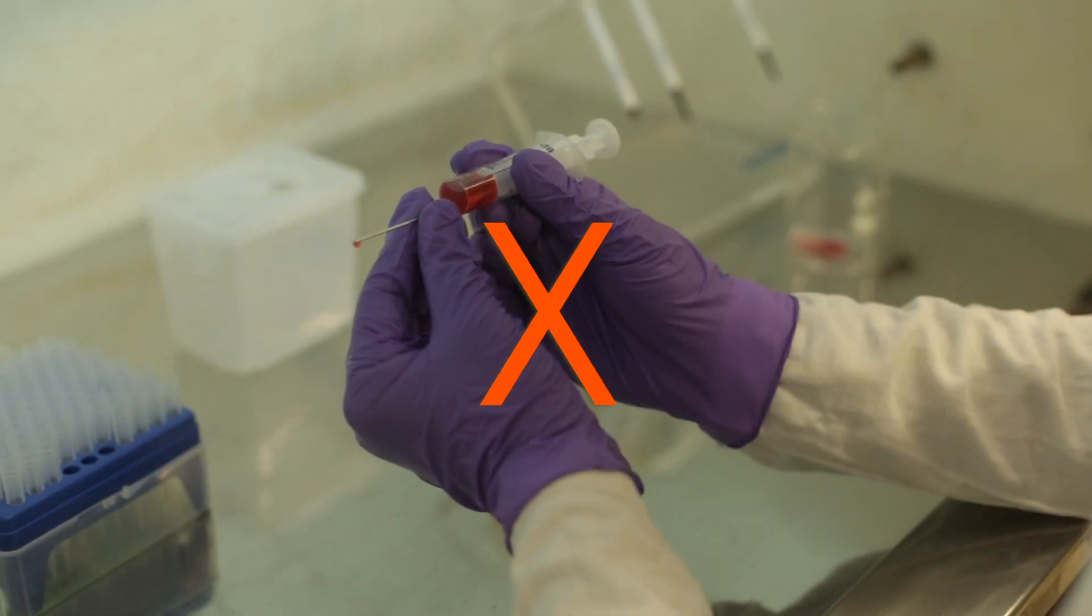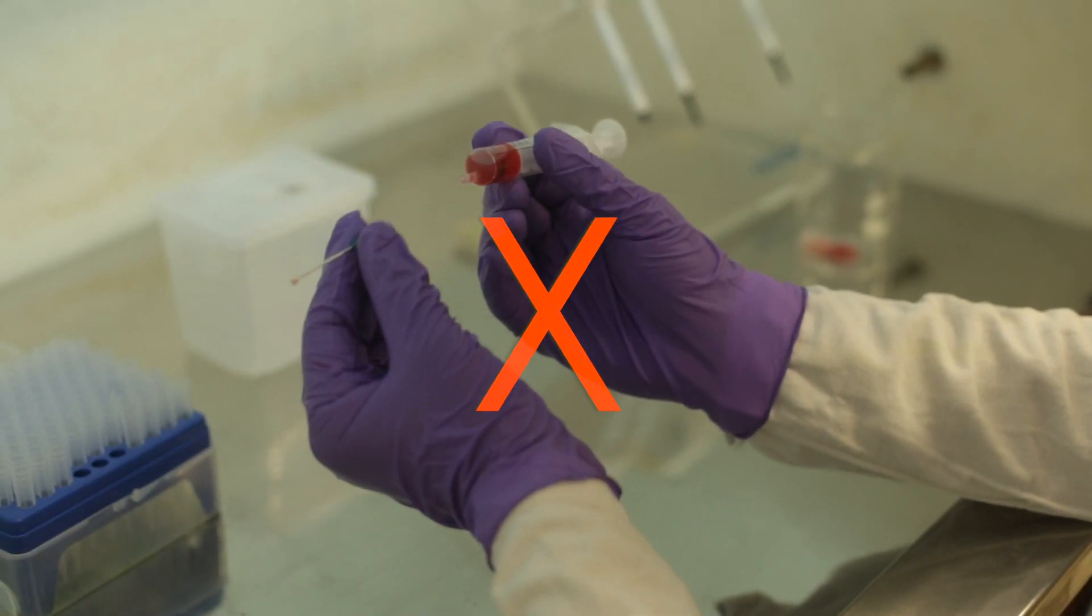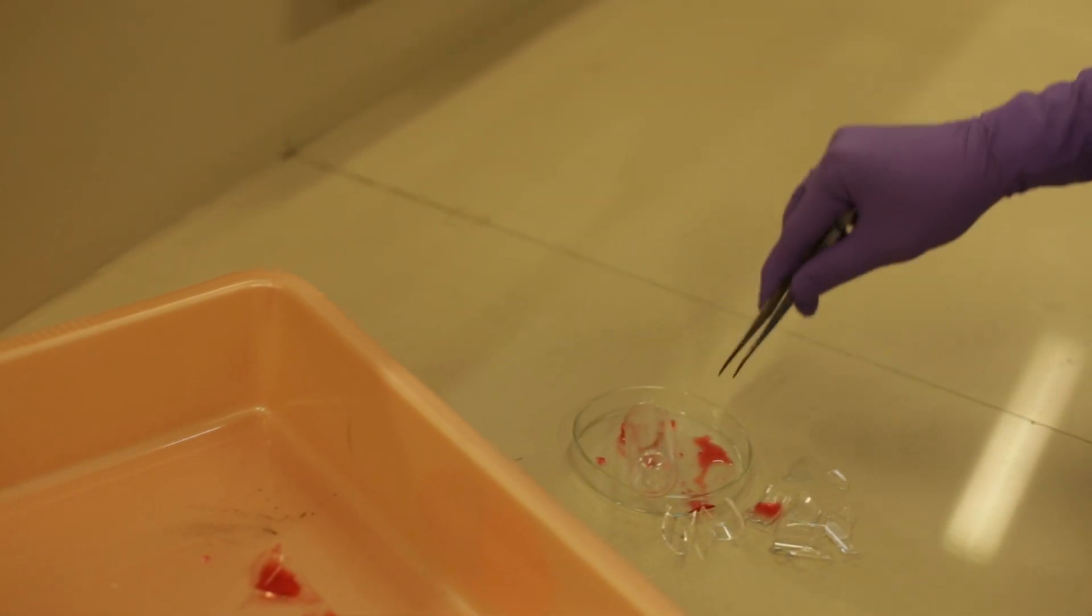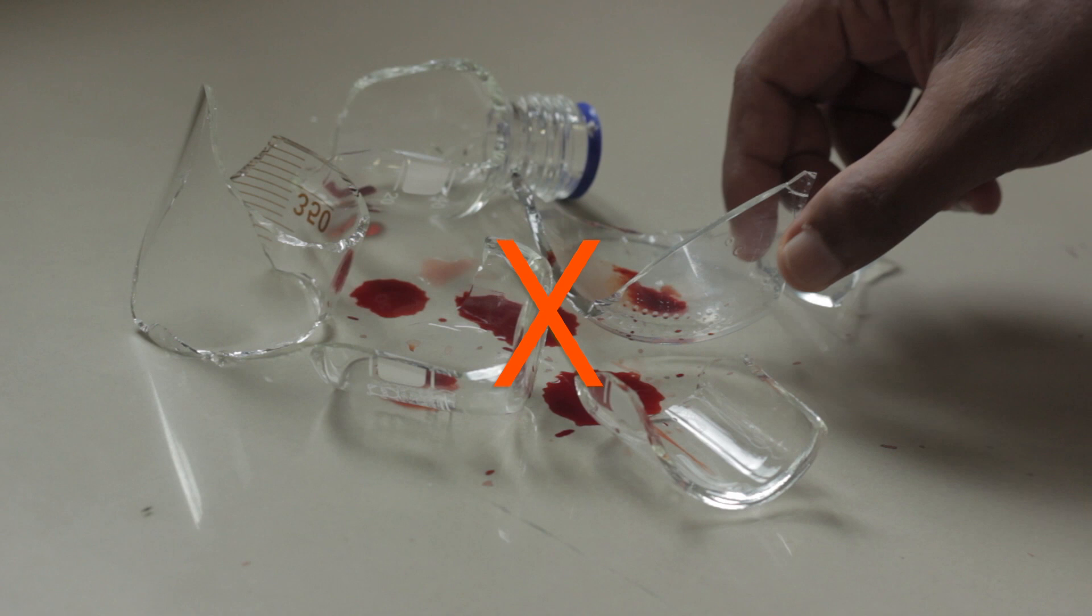Never recap syringes or try to remove them from the syringe as there are chances of injury during the same. Use tweezers to pick up contaminated sharps. Never pick up contaminated sharps with your hands.